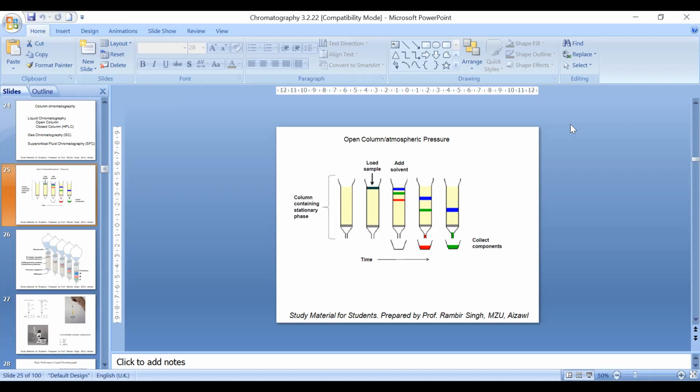So in an HPLC column, we have increased the retention sites to around 1 crore and we have enhanced the performance. But the pressure word was actually misleading. Initially, two words came. One is MPLC, you can write down, medium pressure liquid chromatography, and another is HPLC, high pressure liquid chromatography. So a pressure of up to 50 bars was termed as medium pressure. And from 51 bar to around 300 bars, like the machines we have in the market at present, was called high pressure.